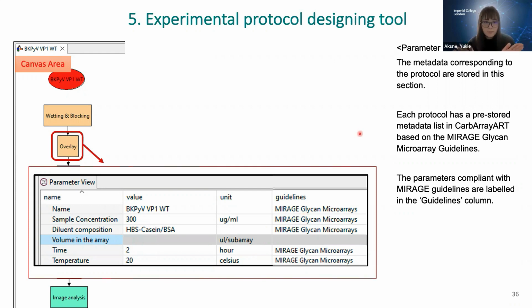So this is the experiment protocol design. You can create your own protocol, of course, and you can share the protocol with your colleague, or you can include it in your report as well.